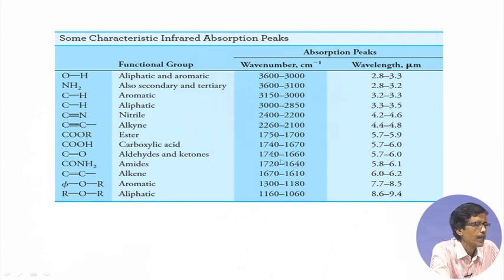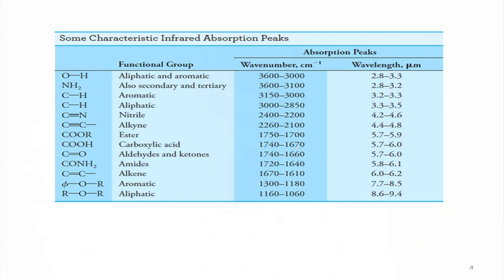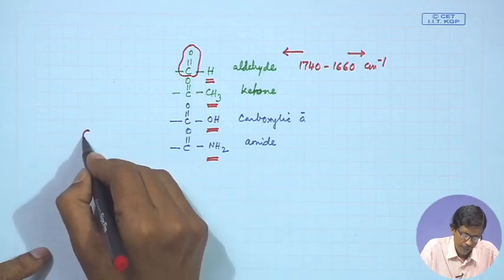So, these three together we can remember very nicely, because we want to identify the presence of carboxylates also. It can be different metal salts, that means metal acetates like copper acetate or iron acetate, and sometimes this carboxylic acid function can be a little bit complex also, because we all know what happens when we talk about the binding to a copper center in copper acetate.